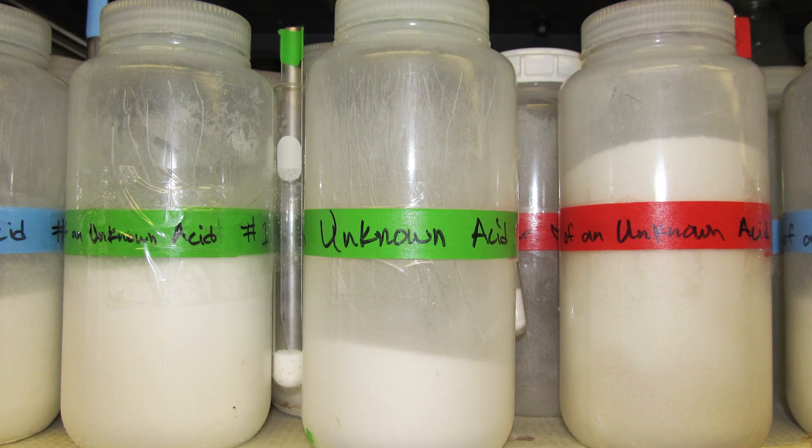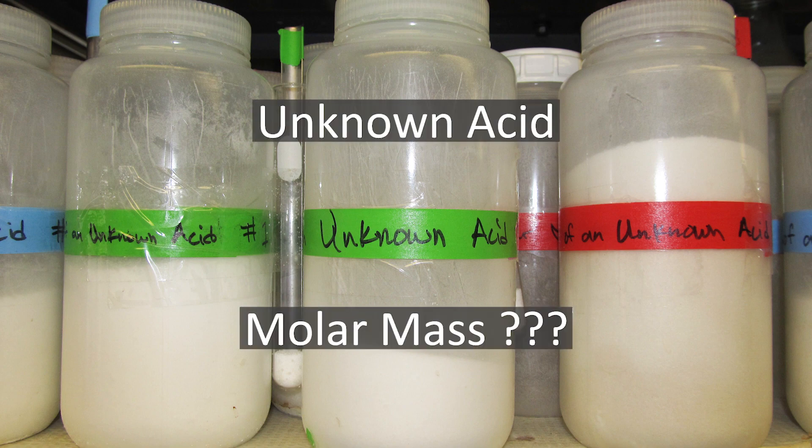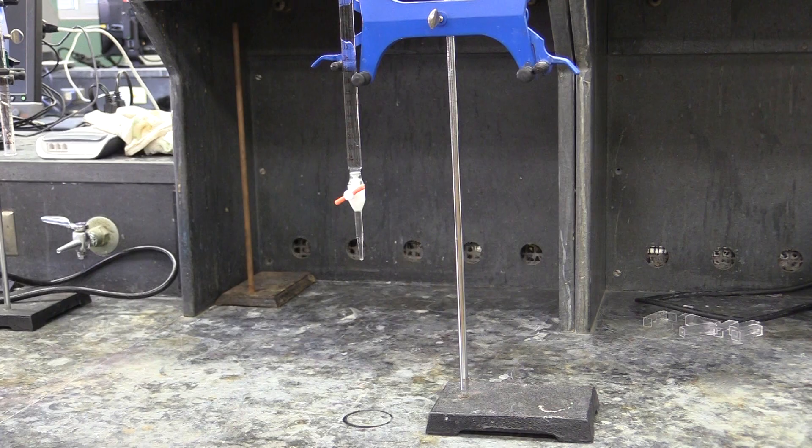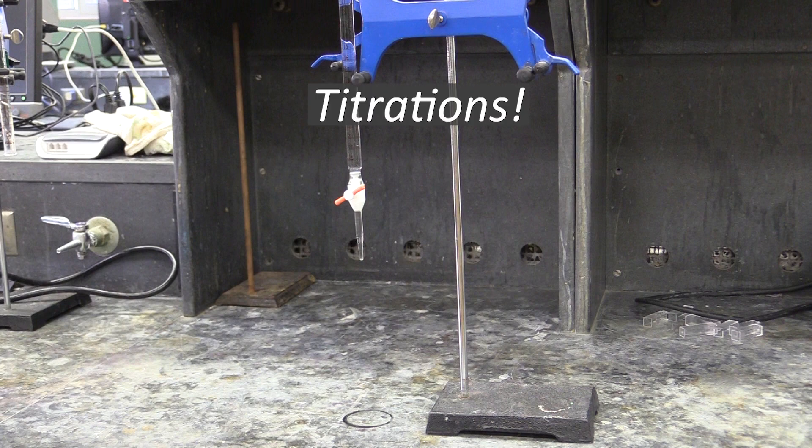Greetings 105 students! This is Ryan, here to tell you what you'll be doing in the molar mass of an unknown acid experiment. As you may have guessed from its title, the goal of this experiment is to determine the molar mass of an unknown acid. The technique you'll use to do this is the titration, more specifically an acid-base titration.